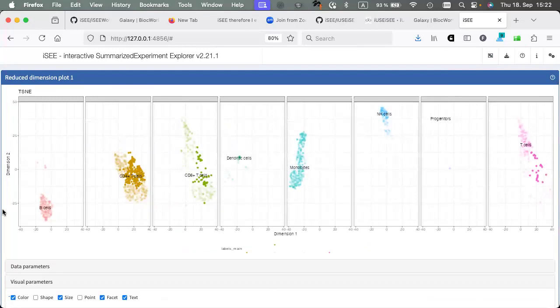If it's something interesting, you can imagine that you can actually have a very good eyeballing on the differential abundance between conditions. And you can actually have it, let's say, color by condition, split by replicates, so that you can actually have an idea of how reproducible and how robust your results might be. And there's a lot of things that you can do like this.